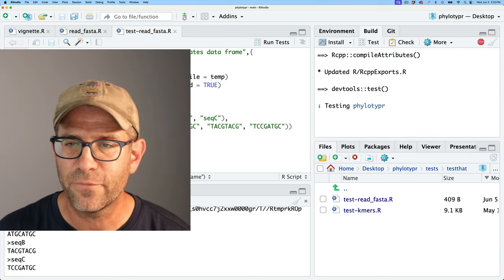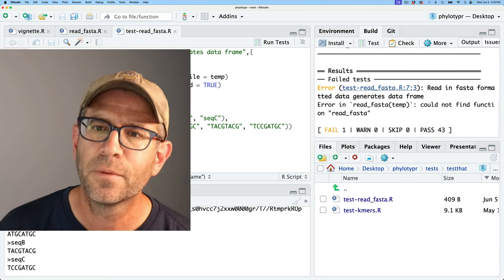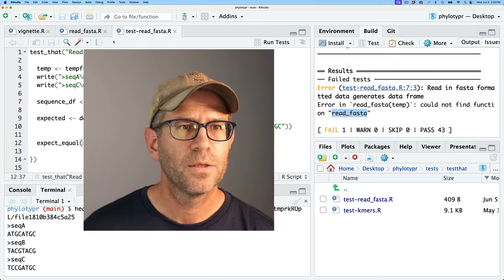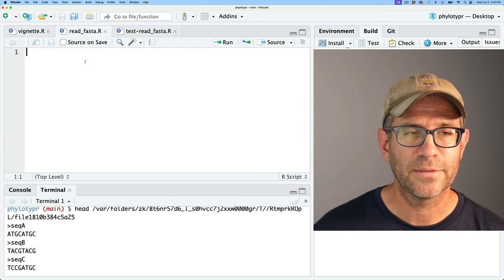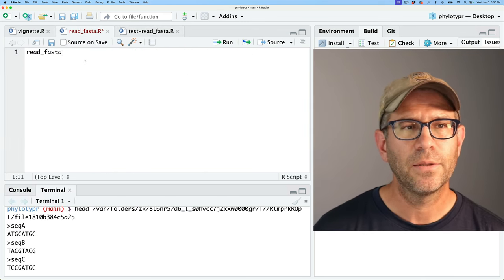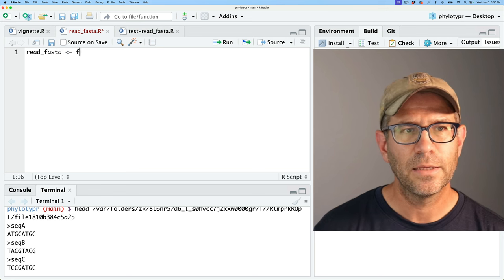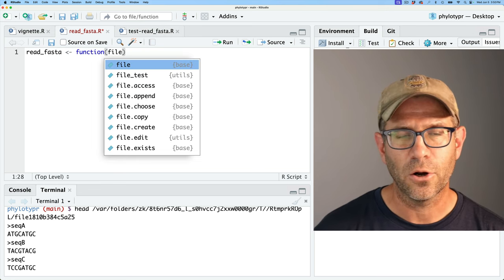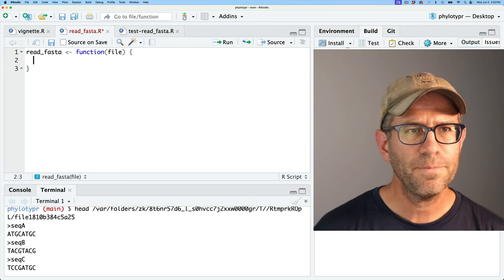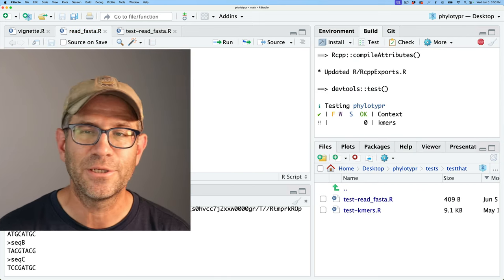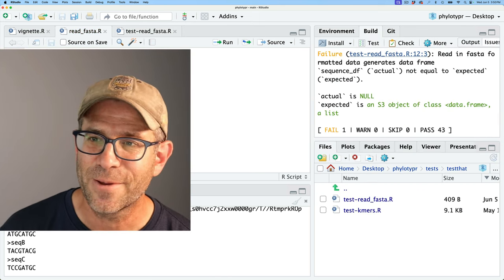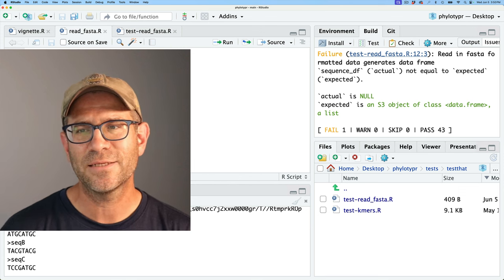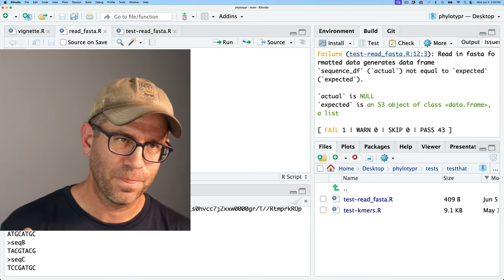Save and test — that should definitely fail. Sure enough, it fails because it couldn't find the function read_fasta. So we'll go back to read_fasta.R and define: read_fasta <- function(file) {}. Save and test again, and now we get a different error: actual is NULL and expected is an S3 object of class data.frame.